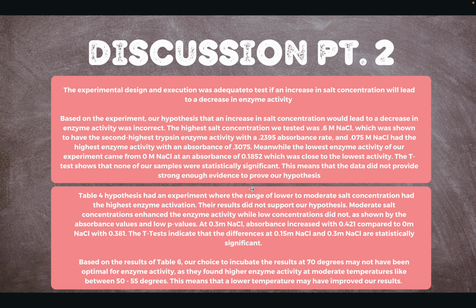Part 2. So this is discussing the actual data. So first, the experimental design and execution we felt was adequate to test if an increase in salt concentration would lead to a decrease in enzyme activity. Based on our experiment, our hypothesis was incorrect.